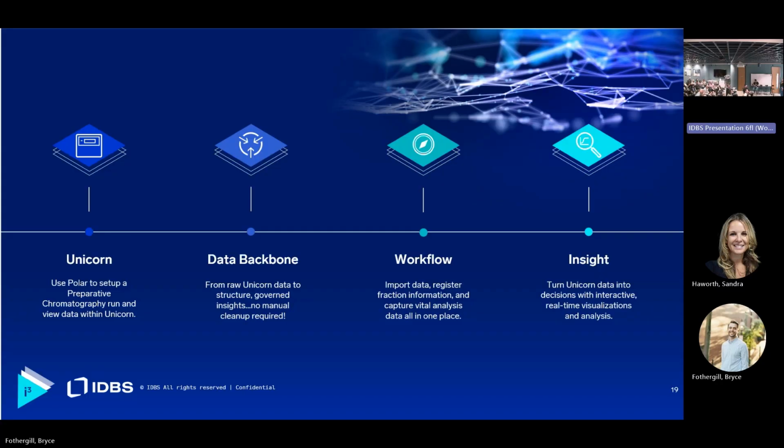So the way it works is through what we're calling an integrations gateway. So really it's a specific technology component that still has to live on premise, right? And that's done deliberately to essentially eliminate the challenges you've just spoken about. So we saw with some of our older interfaces developed in the on-premise era, before we were really a cloud organization, now we know we can port these and run them in a cloud context, but that's really all we're doing, right?